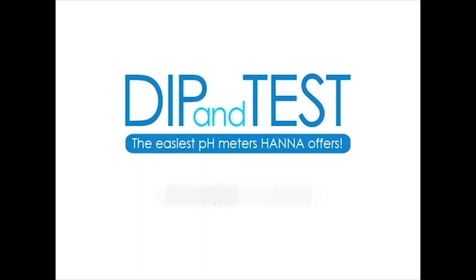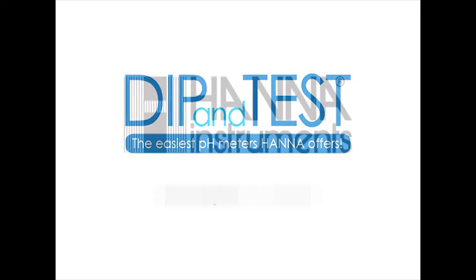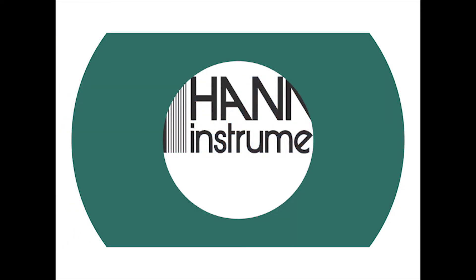Go get your HI991003N pH, millivolt, ORP, and temperature meter and dip and test today.